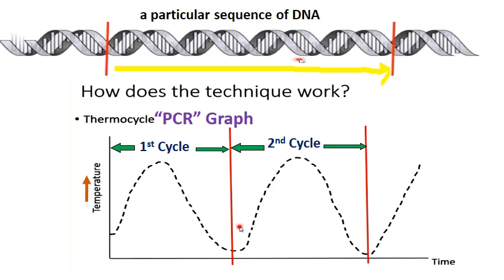This technique depends on what is called thermocycles, as illustrated in the PCR graph. It depends on increasing the temperature and decreasing it within a few seconds.